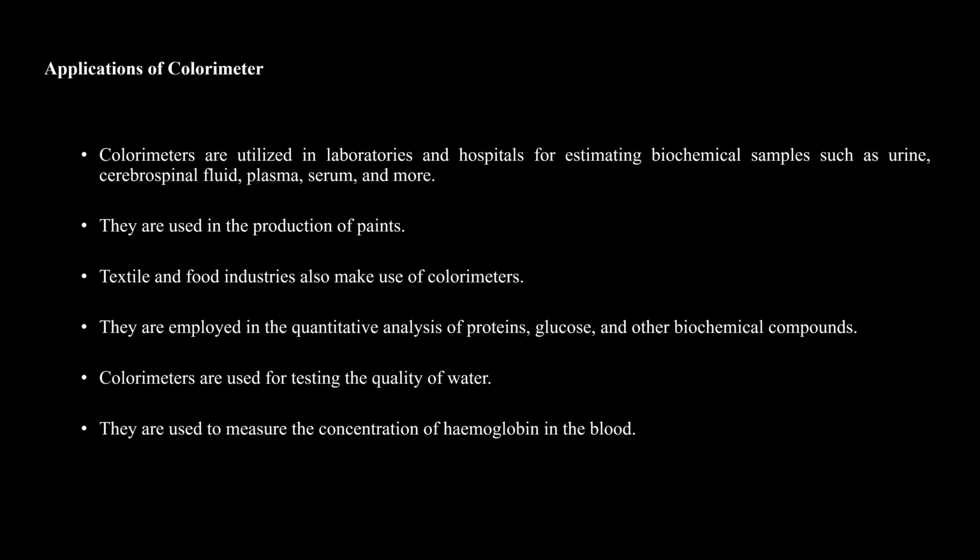Applications of the colorimeter: it is used in laboratories and hospitals for biochemical samples such as cerebrospinal fluid, plasma, serum and more. It is also used in the production of paint and in industry. It is employed for quantitative analysis of proteins, glucose and biochemical compounds, testing water quality, and measuring the concentration of hemoglobin in blood.